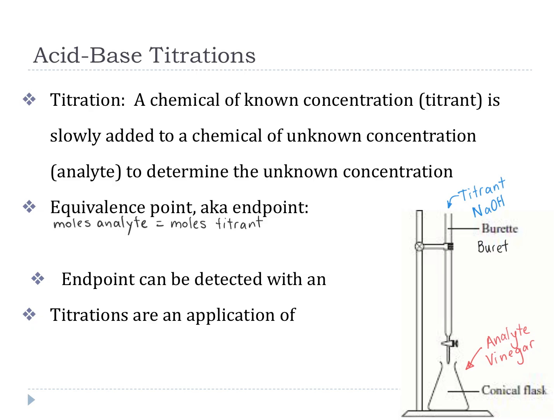And what we often do, and what we will be doing in this titration, is using an indicator to detect the end point. The end point is the point where an indicator changes color. And we are going to use an indicator called phenolphthalein, and that indicator is clear in the presence of acids and pink in the presence of bases.